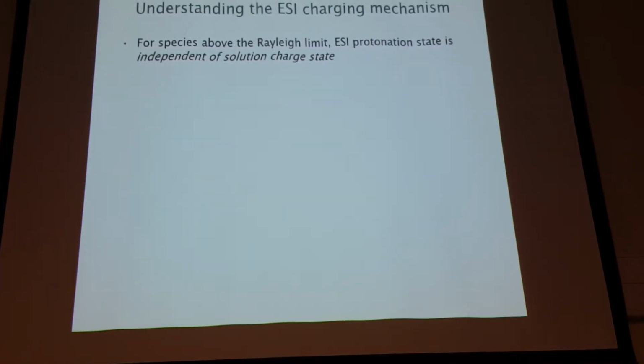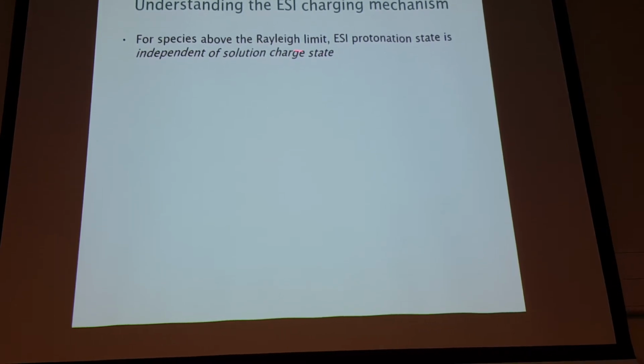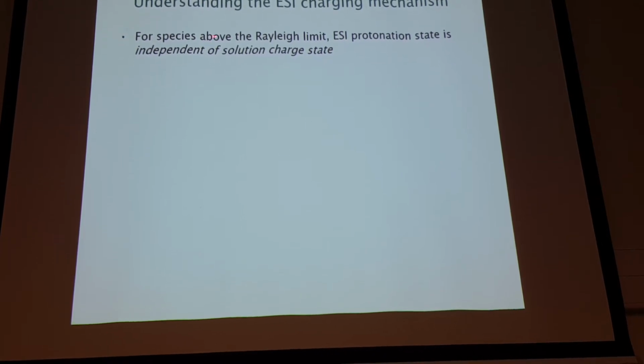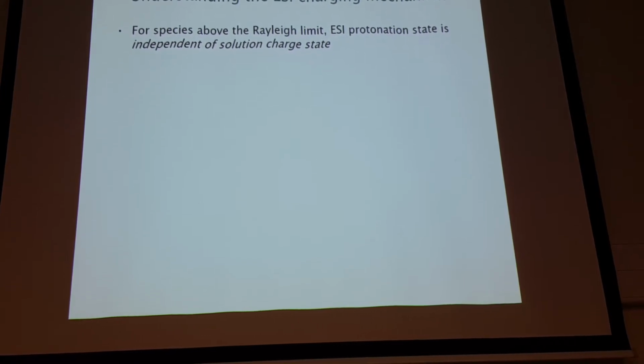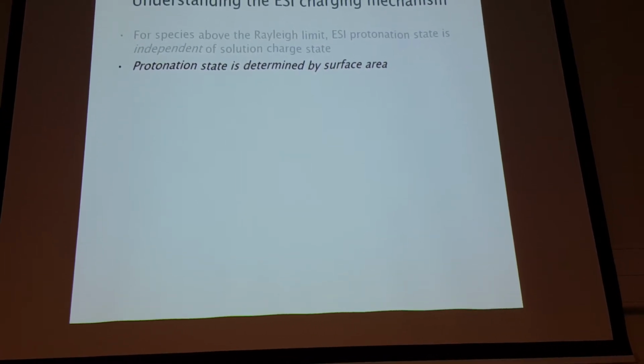So I hope I have made it clear up to this point that for species above the Rayleigh limit, I'm trying to explain what that means, but basically large species, the protonation state is absolutely independent of the charge state in solution. Protonation state is determined by surface area.